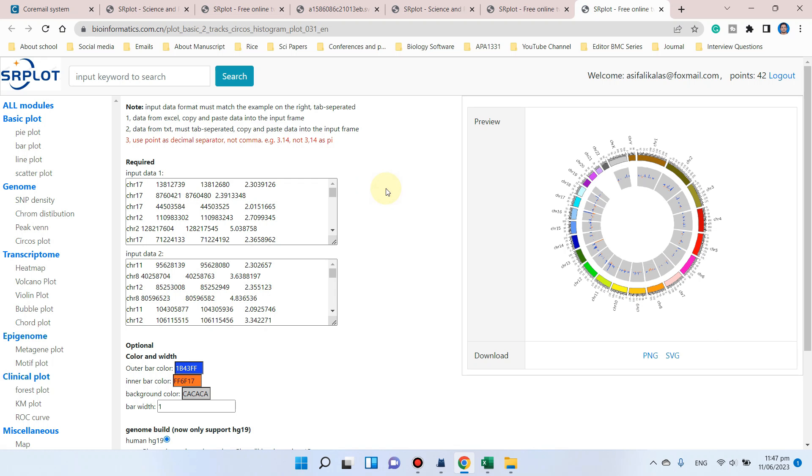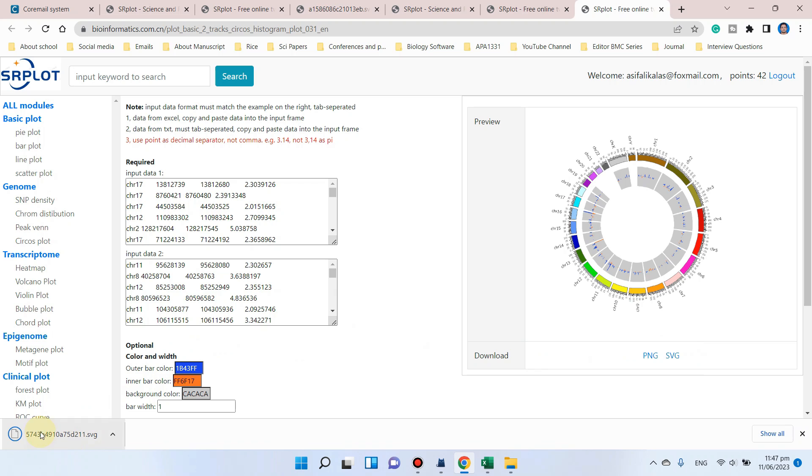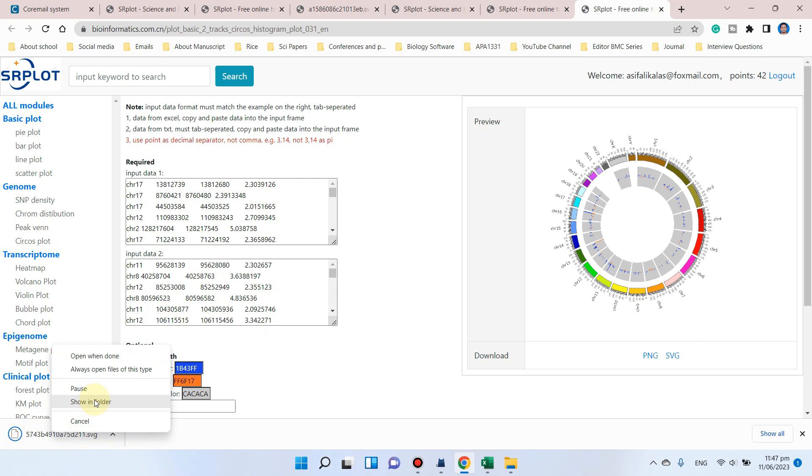It takes just a few seconds to draw this circle plot. Now you can see our circle plot is ready to download in the form of PNG, and it is also ready to download in the form of SVG.